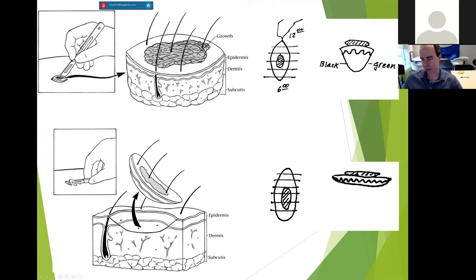So if you're looking for a melanoma that's composed of all single melanocytes and is trailing off at the junction, it's very difficult to know if you're running into a little lentiginous junctional nevus at this margin here when you're doing it on-face. Whereas if you bread loaf it like this, you can easily see where the lesion actually stops and a new nevus that you're running into begins. So I just wanted to bring that up, as with everything in life, you gain some things by doing it on-face, i.e. you're seeing all the margins, but you lose seeing the lesion.